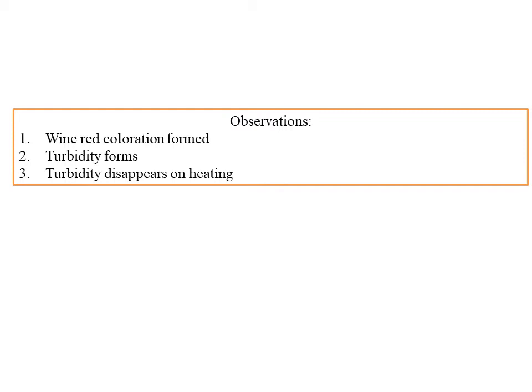Phenol is basically hydrophobic. It doesn't dissolve very easily in water. Previously the phenol got mixed with glycerol very easily, but the moment water is added, it became turbid, which is basically due to the presence of phenol. Since phenol is not highly water soluble, the interaction of the phenol with the water led to the formation of the turbidity.